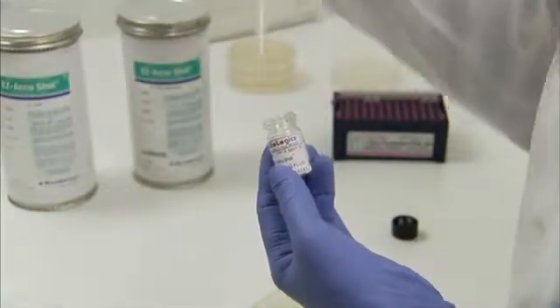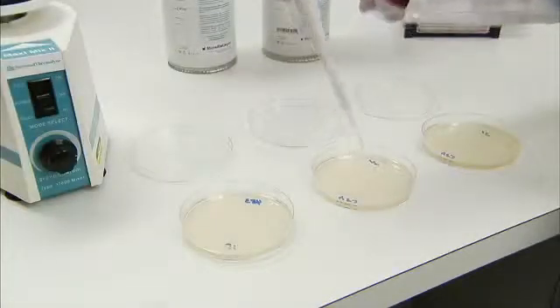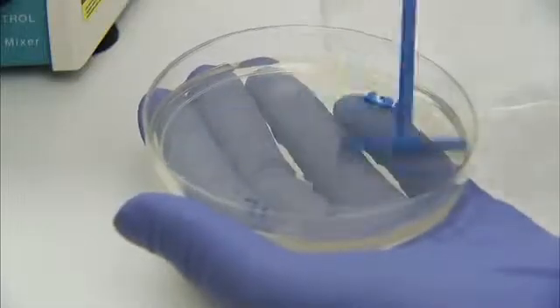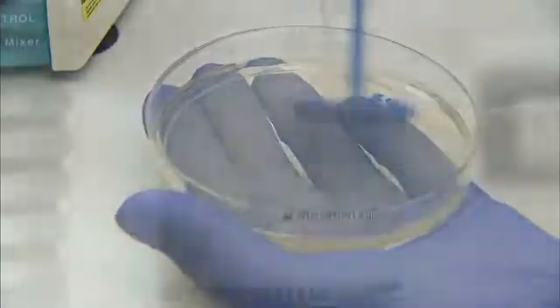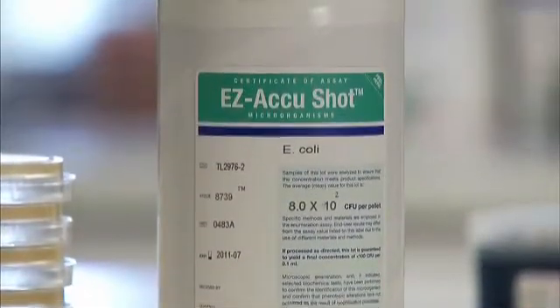With a sterile pipetter, transfer 100 microliters of the hydrated suspension to the media plate. Spread inoculum evenly across the plate. Allow the plate to dry before inverting. Incubate according to pharmacopoeia requirements. Store unused suspension in the refrigerator. It can be used for up to 8 hours.